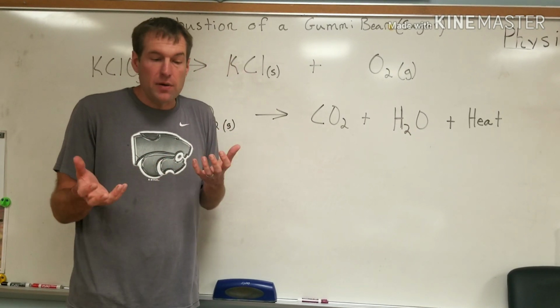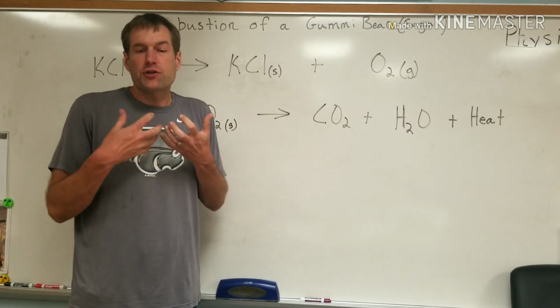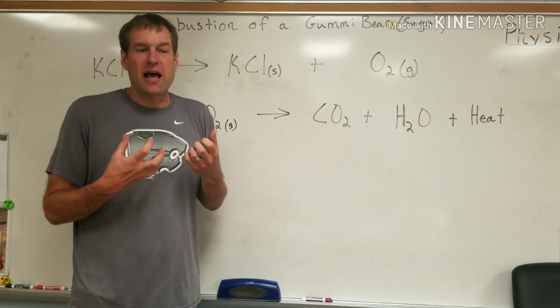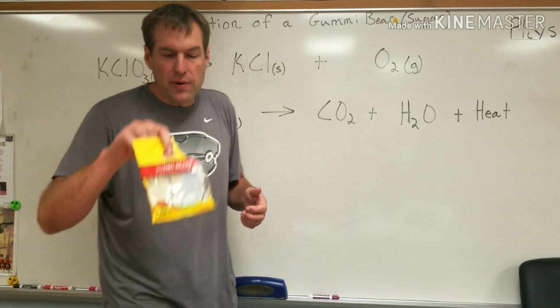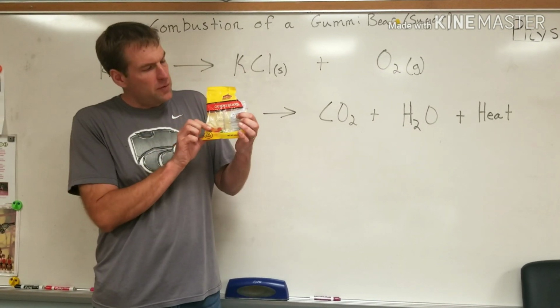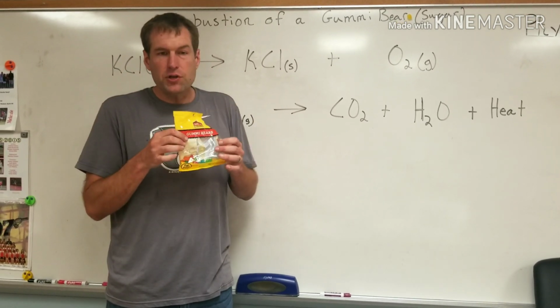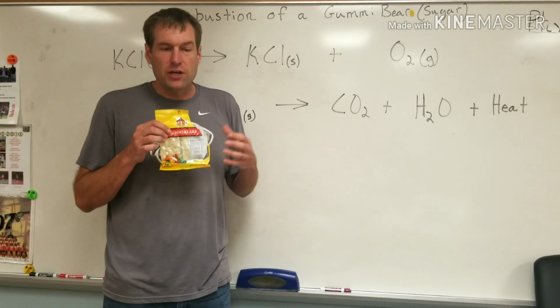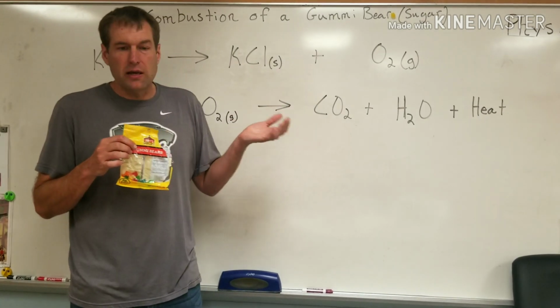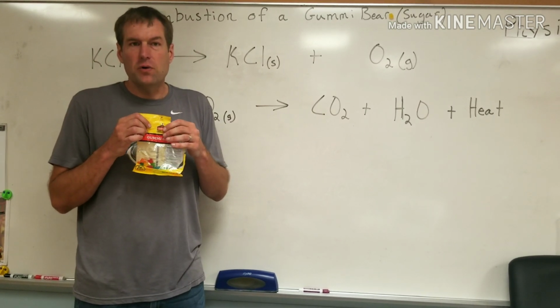Now, if you eat a gummy bear, you know that it has chemical energy, and sugar is very energy dense. If you eat too many gummy bears, you're probably going to put on some weight because you'll have excess caloric consumption, and your body's going to store that. So sugar has a lot of energy, and hopefully we'll be able to see that visually with this demonstration. Let's go back to the fume hood and try it out.